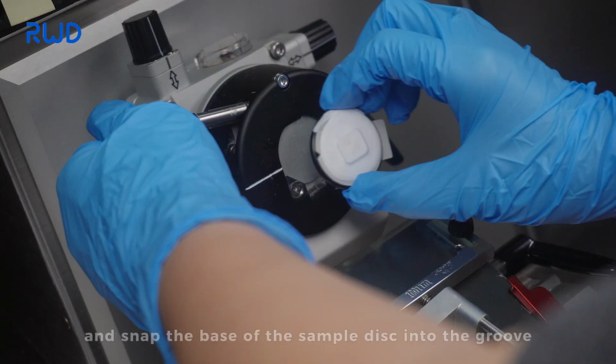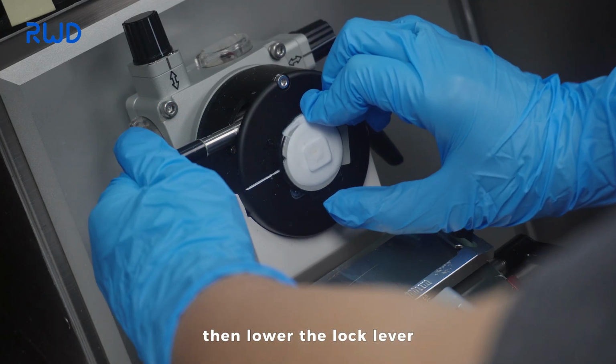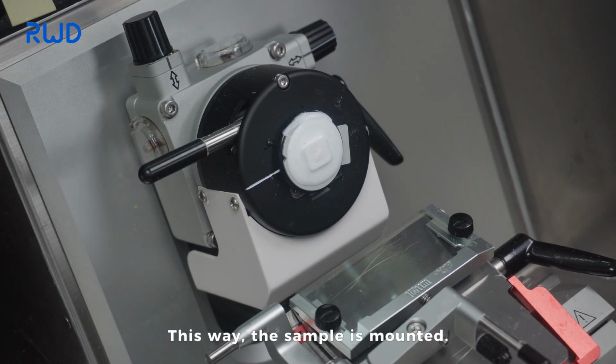Lift the locking lever and snap the base of the sample disc into the groove. Then lower the lock lever. This way, the sample is mounted.